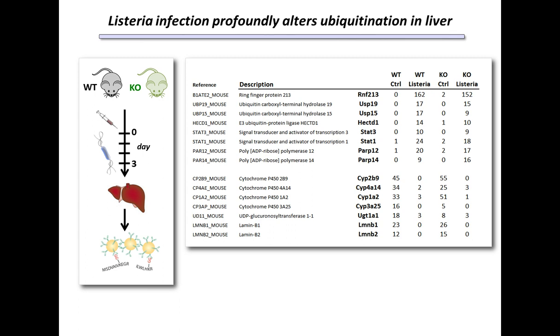Now, I've shown you a whole series of studies that have been carried out in cultured cells, but of course, these types of experiments can be equally well done in tissues under the right circumstances. And for that, I want to just show you some data that was collected in a Listeria infection model in wild type and knockout mice.